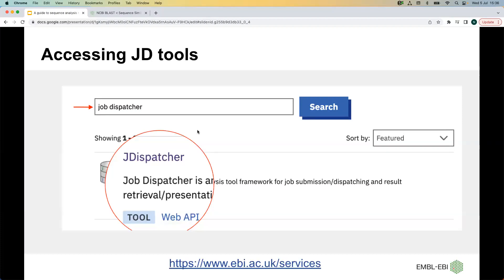To access our tools, you can either go to the EBI service page at www.ebi.ac.uk/services, type the tool name, and go to the respective tool homepage. We also recently added the Job Dispatcher service to the list of EBI resources, so when you type Job Dispatcher it will take you to our new website, which is under development but is functional — you can still run your analysis without any issues. We will discuss more about our new website in the coming slides.